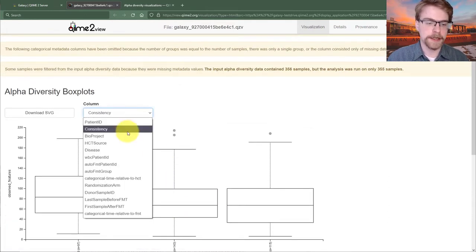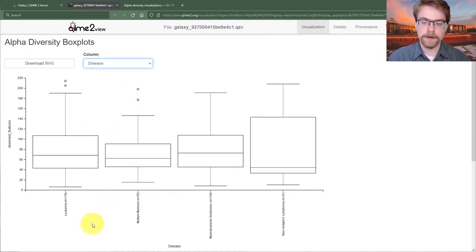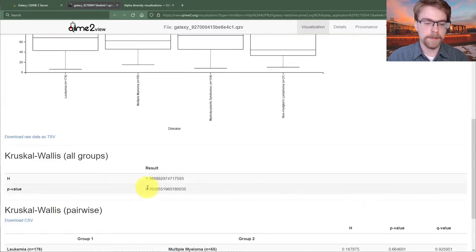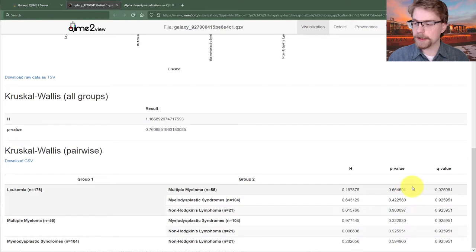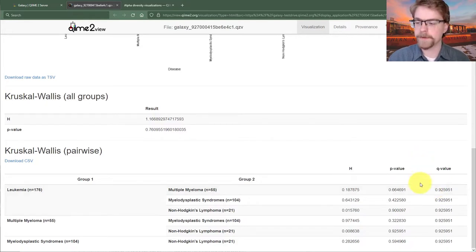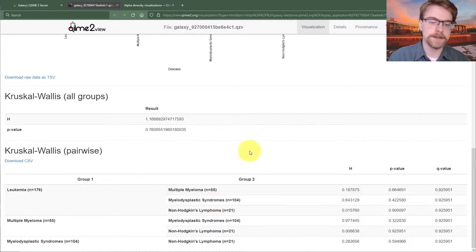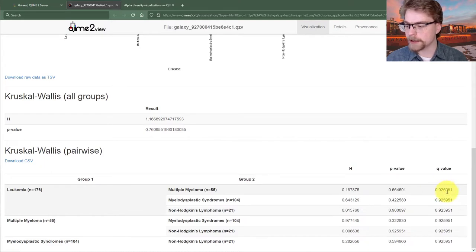We might also be interested in disease — looking at that, we see no significant differences. We can also look at multiple comparisons, in which case you'd be interested in the Q-value because we are generating hypotheses here, not validating any. We don't have any a priori expectation that this model makes sense, so we need to use the corrected p-value, which is clearly not very significant.